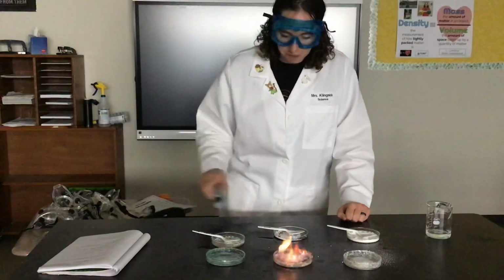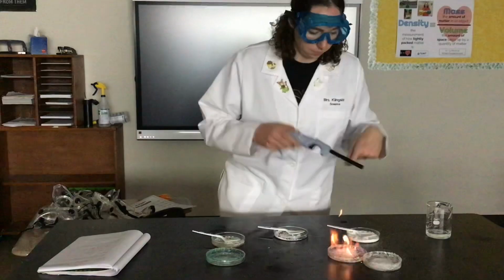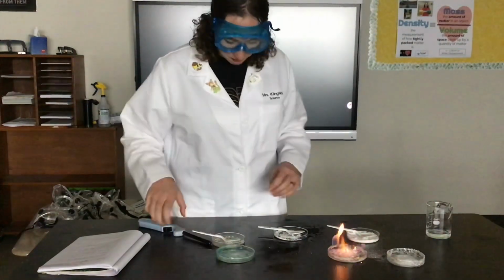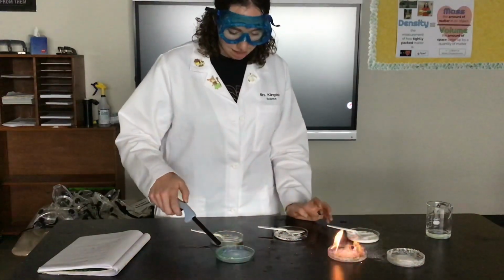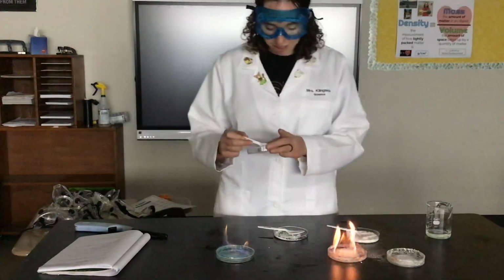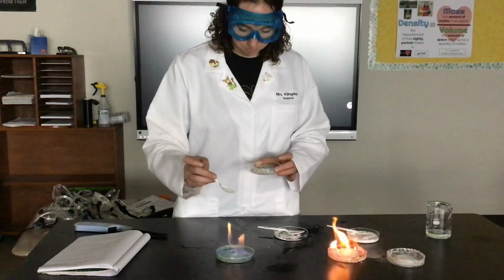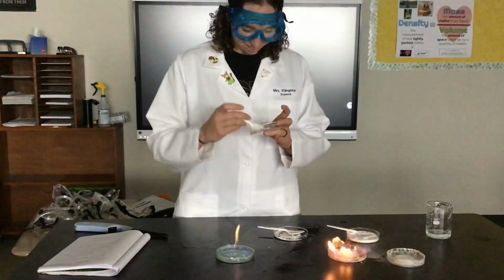All right, I'm actually going to push that to the side. Okay, it's going to keep going, but the next one I want to do is the trio, the three things. So I'm going to light the ethyl alcohol on fire again. Okay, now, watch this flame. Let's see if it changes colors when I add in these new materials. Did you see it? Here, let me do it again.